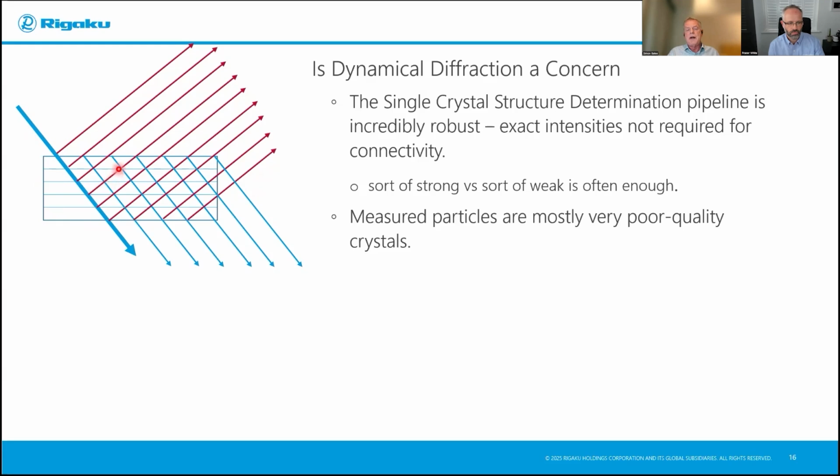And of course, they hit another plane in a perfect crystal, they're diffracted in, and so on. You get this complex beam path through the sample itself. And this looks like essentially an interferometer, which is exactly what it is. And this requires highly perfect crystals, strong alignment of the crystal planes, and you have to be exactly on zone axis to set up this complex interference effect.